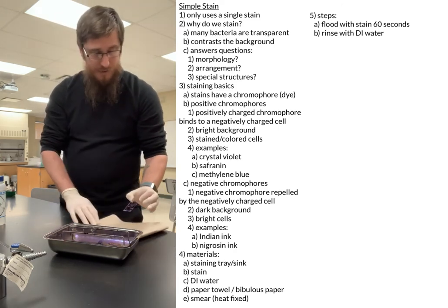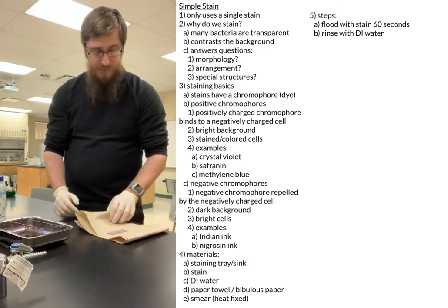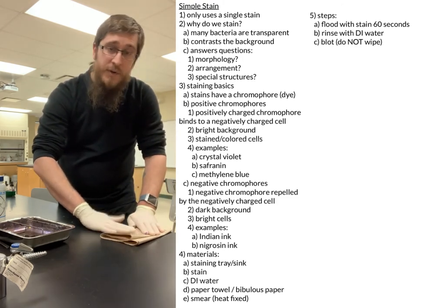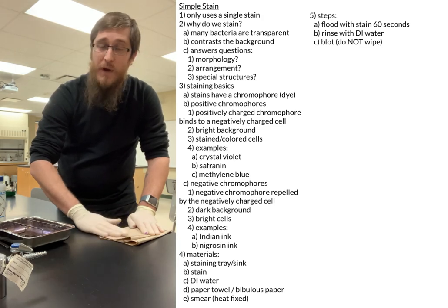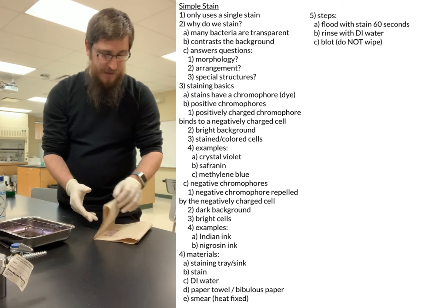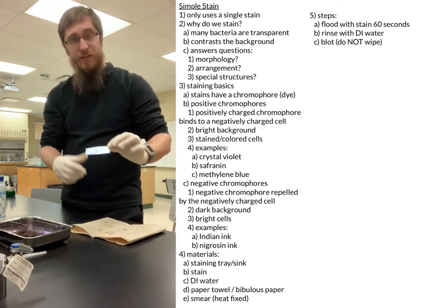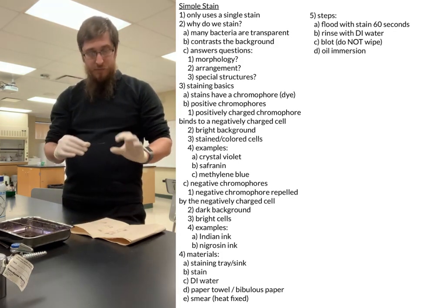Now all we're going to do is put it on our paper towel. Let me move this out of the way, and then we're just going to blot it down. We always blot, we never wipe our sample. The basic thing here is that if we wipe it, we're likely to wipe the bacteria off. So we're just going to blot it down like that. We can give it a bit of time to air dry, but that is our stain ready to go so that we can look at it under oil immersion.